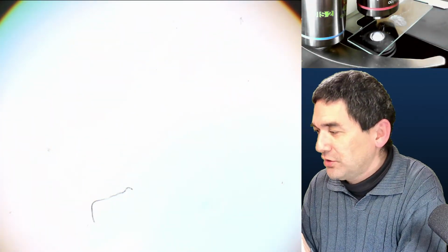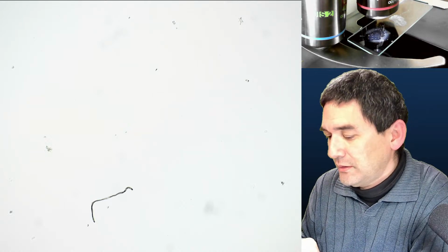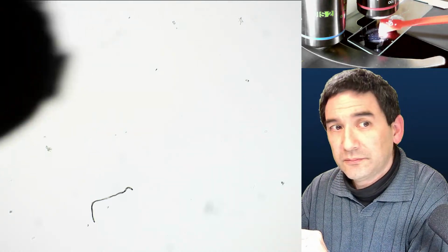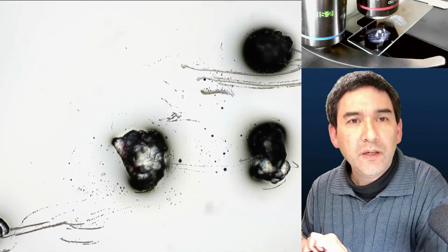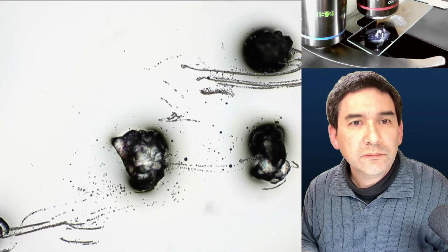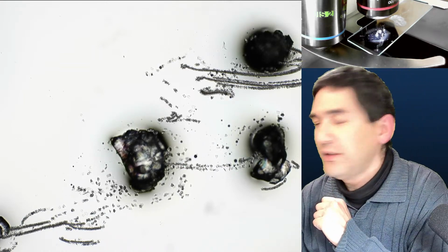And I really don't know what to expect. I don't know if this is actually going to work or not. So let's go down with the magnification so that there's a bigger distance. Just a second, I need to swing out the condenser again. So, and let's see how this works. Okay. So here are some of these crystals.